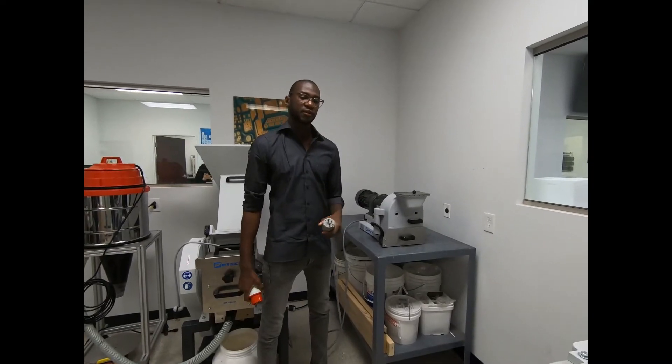The unit is three phase 220 volt. It'll actually come with a European plug on it, so just get your favorite electrician to wire on the US 220 volt plug of your choice.